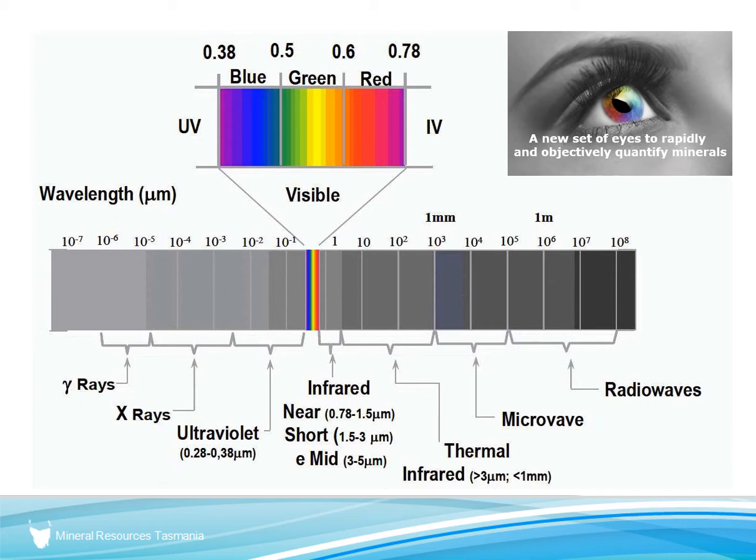With hyperspectral scanning, we're looking at things in infrared light. Two minerals that may look the same in RGB, where both of them are going to be green, in infrared light look completely different. And so that's what we're using. We're using the infrared light just beyond the visible, right out to the thermal infrared, far from what the eye can see.